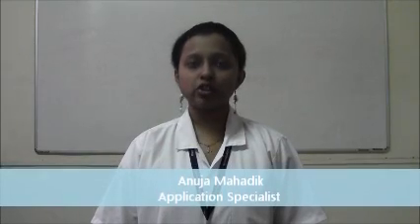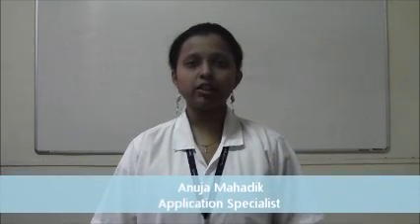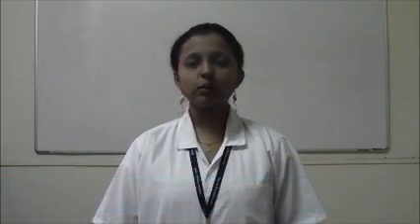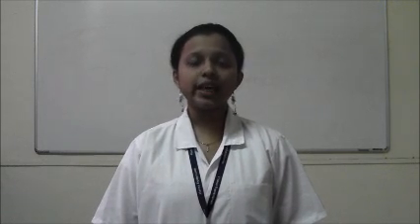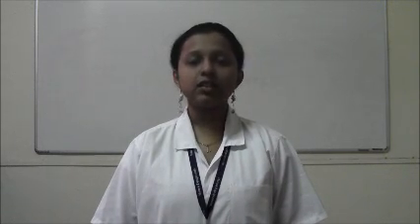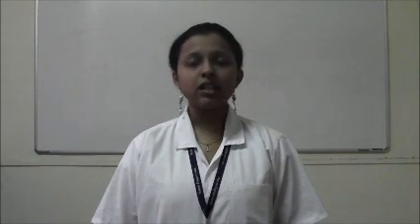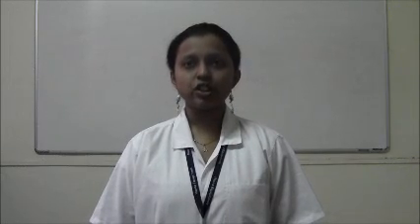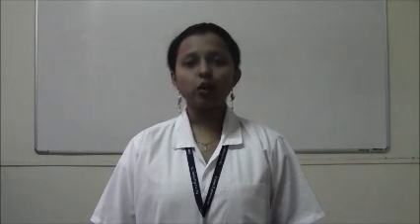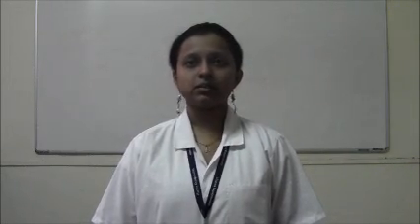Hi, I am Anuja Mahadik. I work as an application specialist in HANA Equipments, India Private Limited. With this video, I am going to demonstrate how to use HI83099 COD and multi-parameter photometer to measure COD in a water sample.